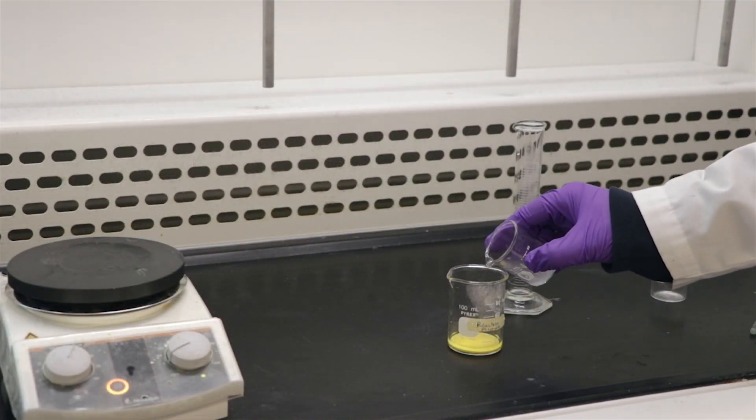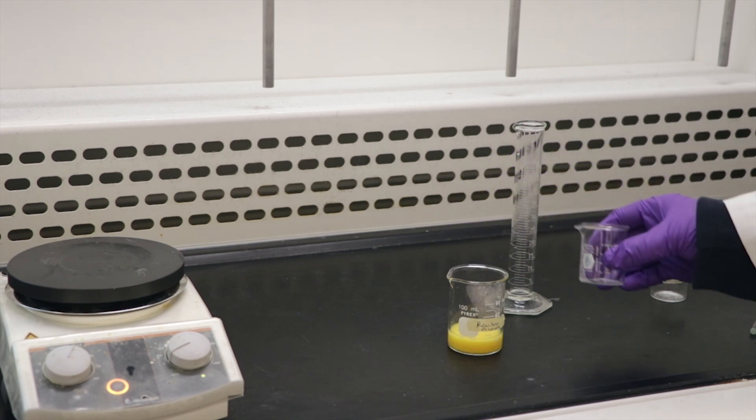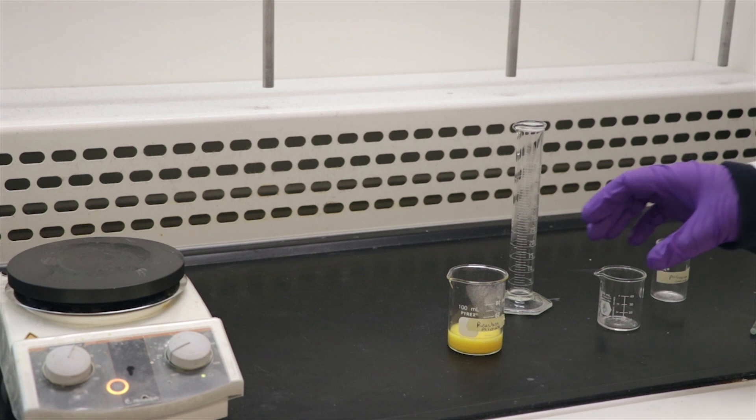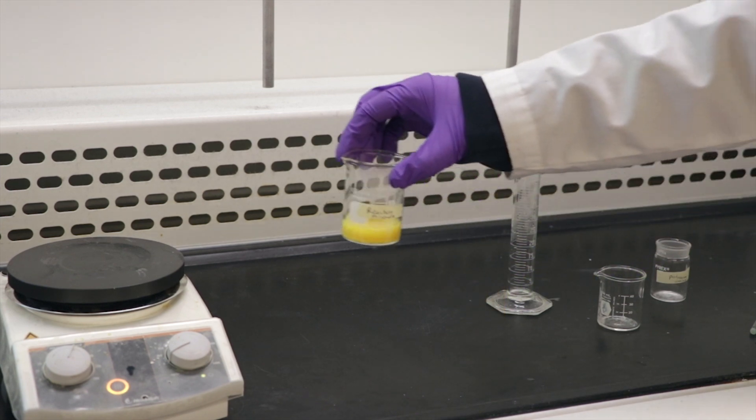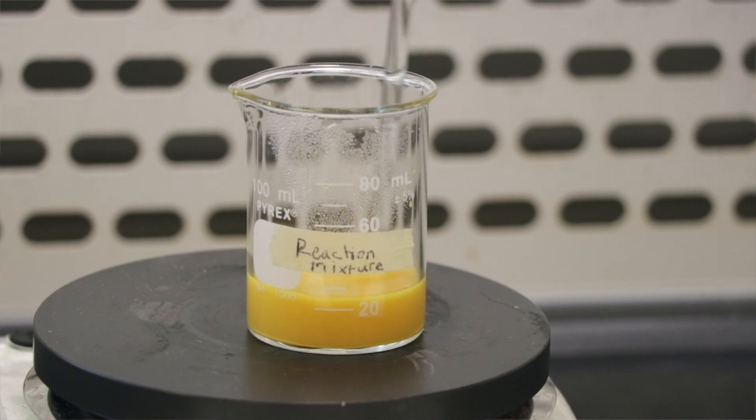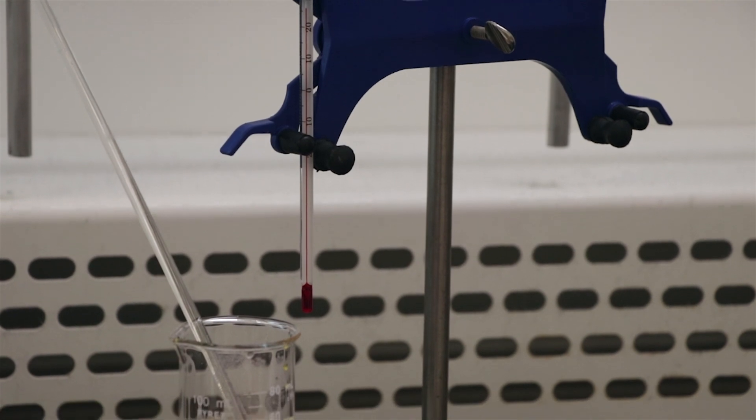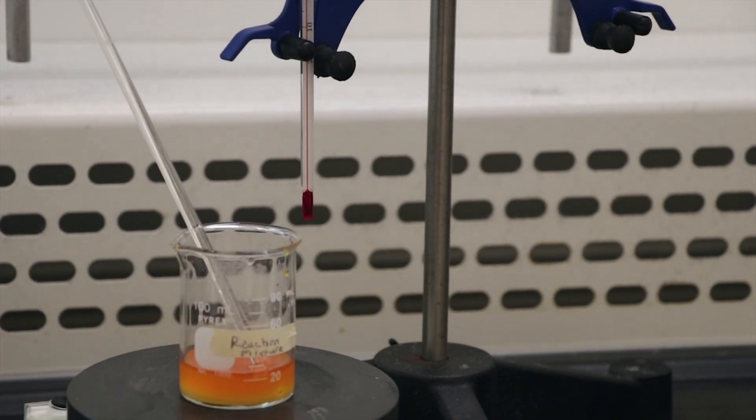Gently add the potassium oxalate solution to the yellow ferrous oxalate solution and place it on the hot plate and stir. You should notice the solution turning into an orange-red color. At this point, you can clamp your thermometer to the retort stand. Turn off the hot plate and allow the mixture to cool down.